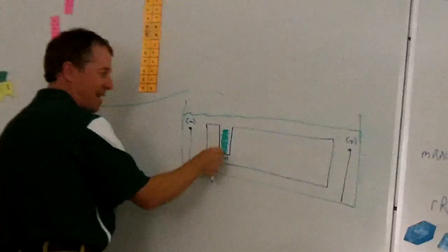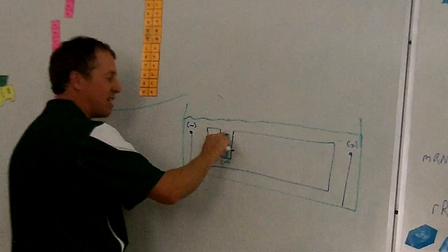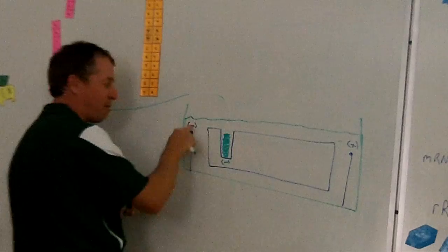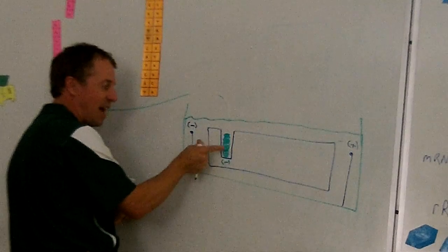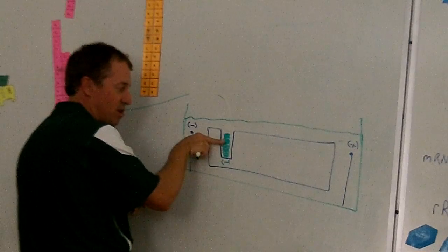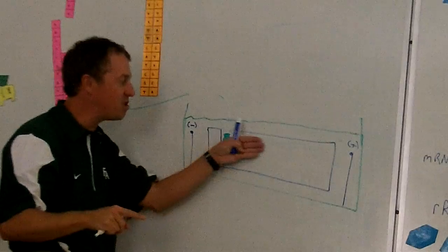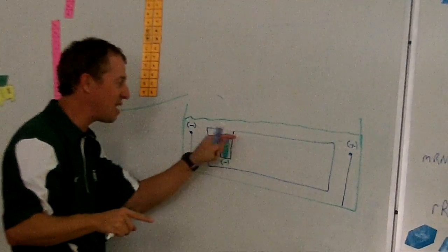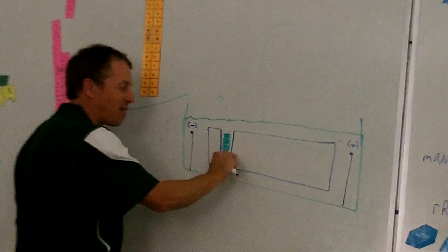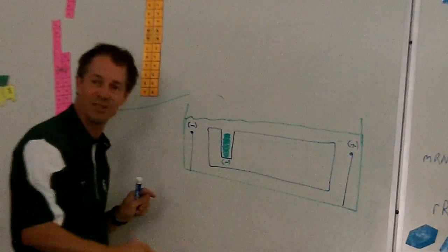So the DNA being negatively charged, when you turn the power on in this gel box, the DNA is going to move away from the negative wire because like charges repel one another and positive attracts negative. So the DNA is going to start moving that way, and it'll go right through the gel. Even though the gel is thick, there are little tiny microscopic holes in it, and the DNA will migrate through those little holes.